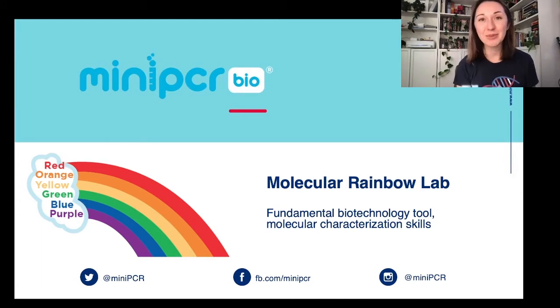I'm Alex Danis, and I'm going to be walking you through the lab today, which is going to help introduce students to characterizing and separating molecules, as well as introduce them to gel electrophoresis, which is a fundamental biotechnology technique.